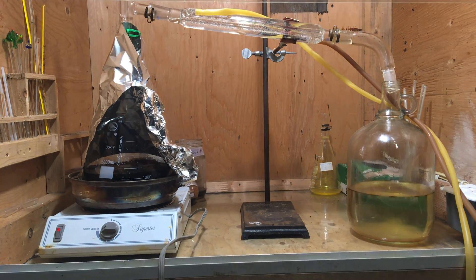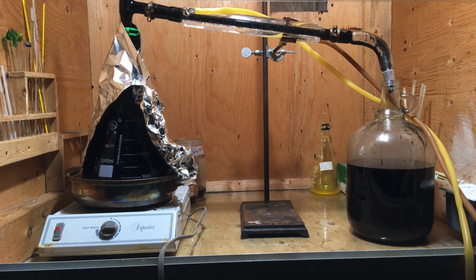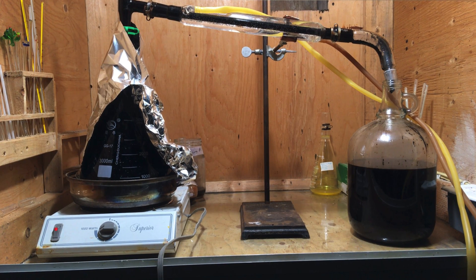The reaction generates a black mess of tar as well, and unfortunately I was not paying close enough attention, and the tar splashed over a bit. The heating should be stopped once the tar begins foaming; however, a bit of tar splashing over is not the end of the world since the products need to be cleaned up anyhow.